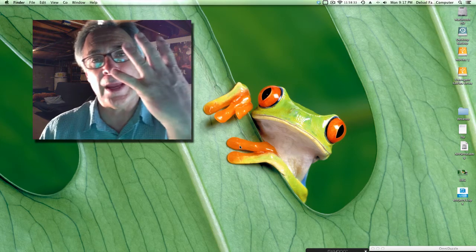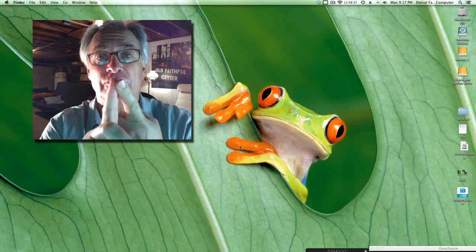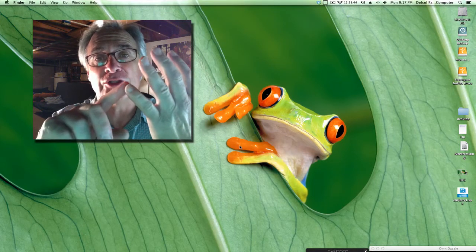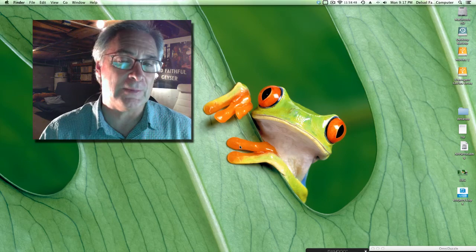And I want you to be able to do four things. Number one is open up or start your data logger. Number two, build your own page, save your own page, and then make changes and print on that page. So those are the four things I'd like you to be able to do today.